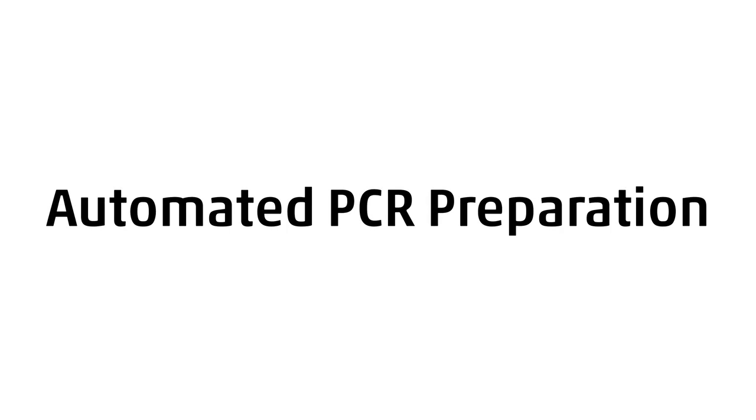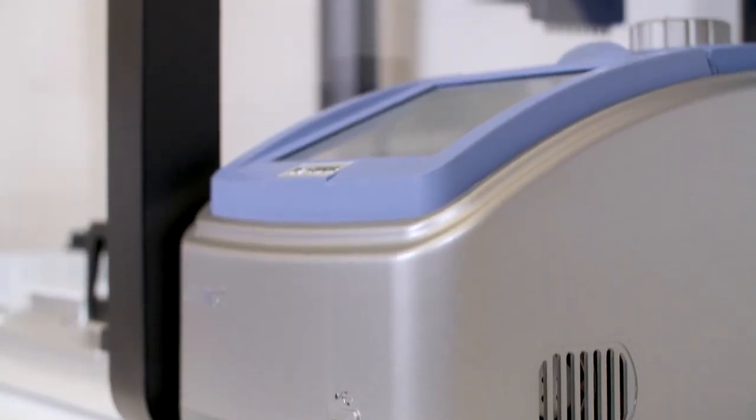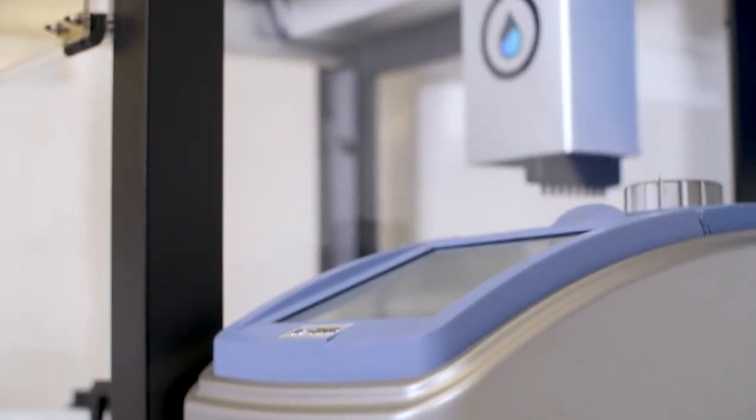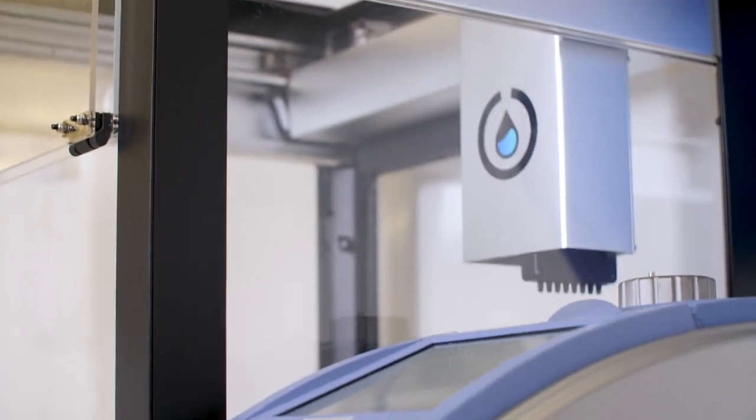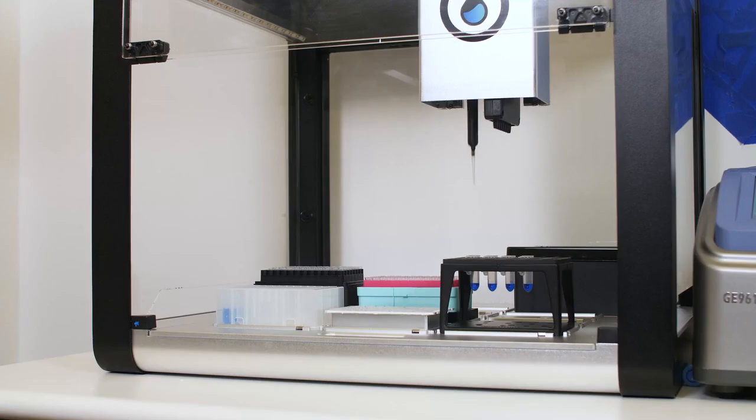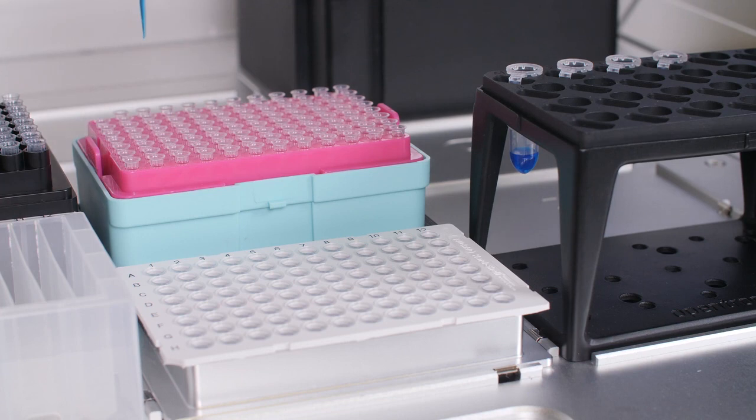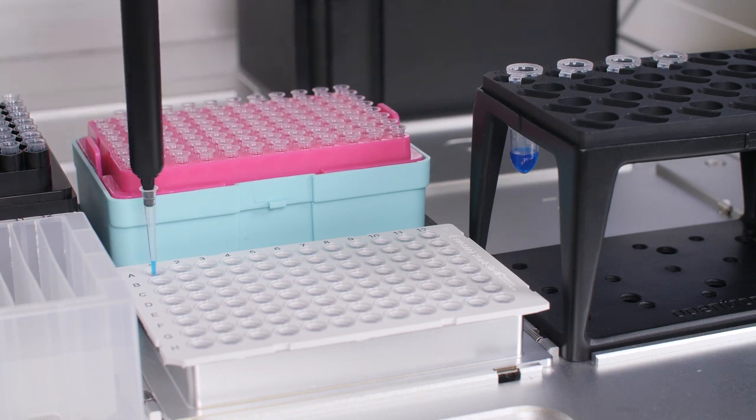This video provides an introduction to automating PCR and qPCR preparations on the OT2, the world's most affordable, high-precision pipetting robot. We've shown that using an OT2 robot can minimize contamination and errors, creating a streamlined automated PCR workflow accessible to any lab.